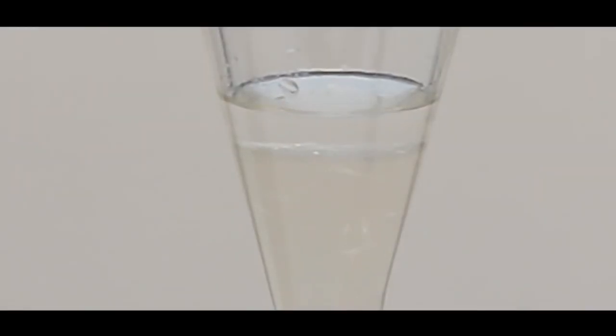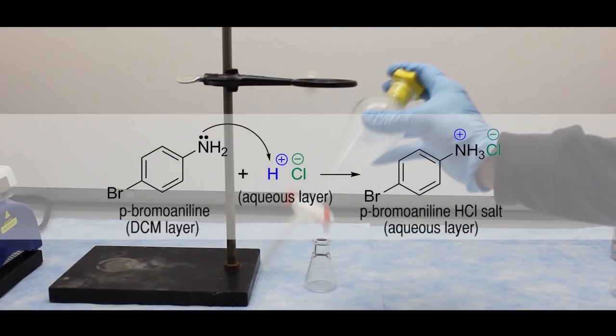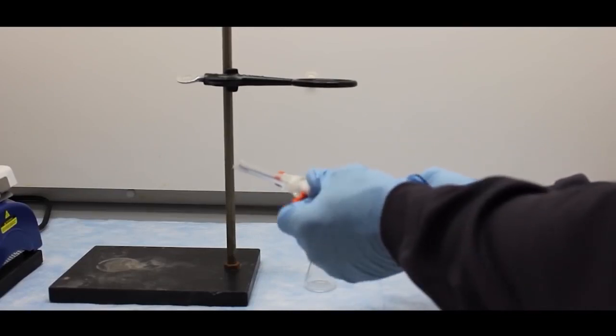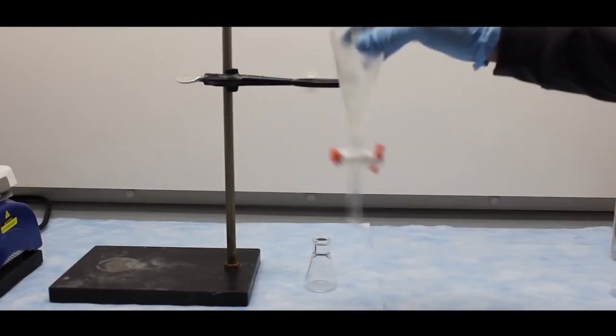Two layers are noticeable. I'm going to cap the sep funnel and shake it to mix the two layers, so the p-bromoaniline that is in the DCM layer will come in contact with the HCl and cause protonation. The p-bromoaniline HCl salt will then migrate to the aqueous layer. I will vent it so the pressure does not build up too much. Shake some more, vent again, shake one more time, and vent one more time.